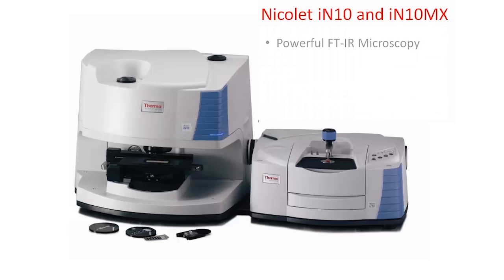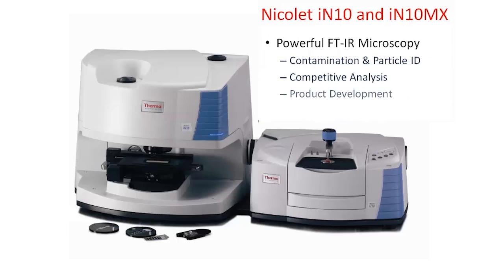Whether your investigations deal with contamination and trace particle identification, competitive analysis, or process support, you will find that the Nicolet IN-10 microscope is an ideal companion.